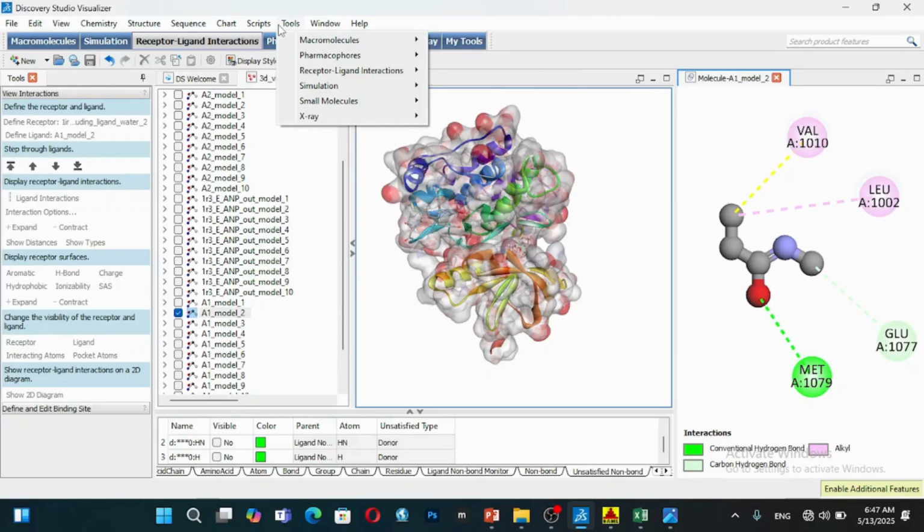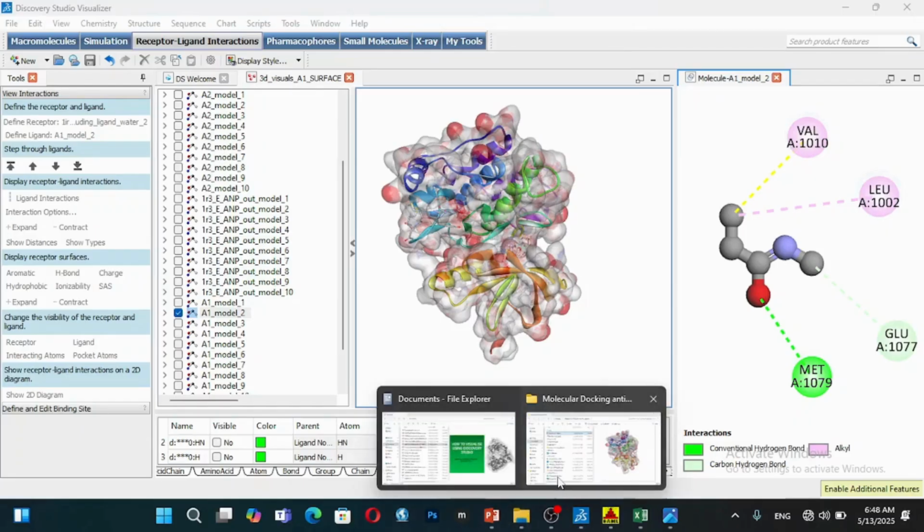There are other tools you can choose to use, but I would love to stop here. So if you have any challenge creating these forms of visualization, please you can always get across to me. But don't forget that you can generate 2D structures, 3D structures, and even surfaces using Discovery Studio. Now, let's see the images we've generated.